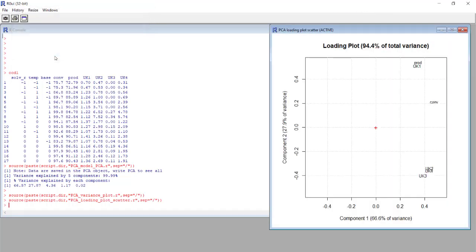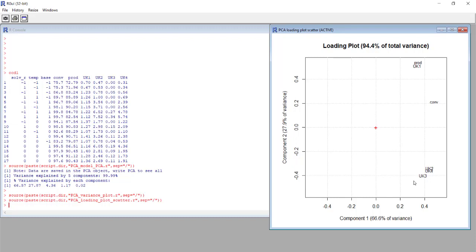Here we see how the different responses are positioned in this loading plot. For example, we see that three of the four unknown impurities are quite close to each other, so this means that the behavior is quite similar in the system and that these three responses are correlated. We see these two responses are correlated.